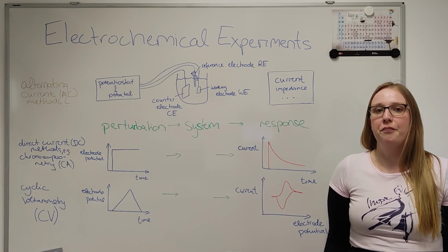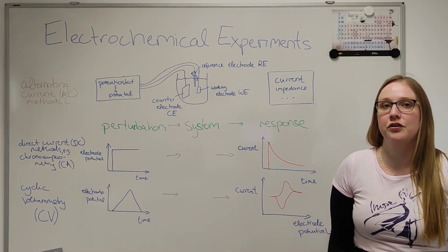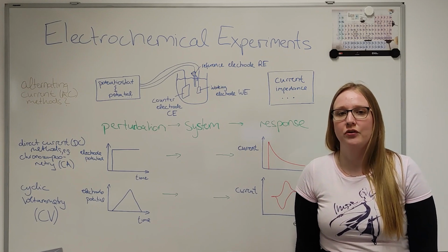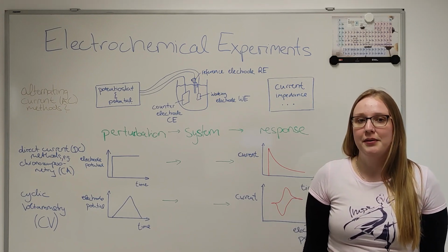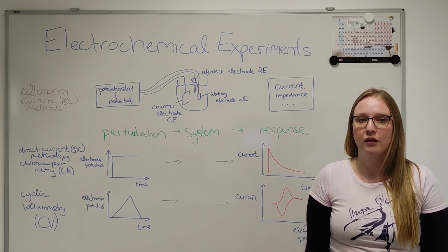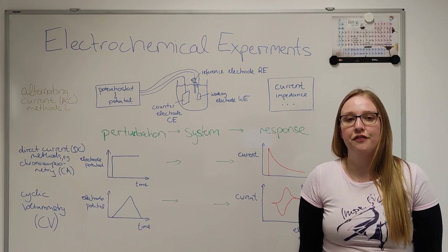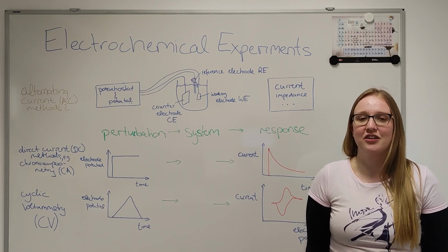The principle of perturbation and system response is the same in electrochemical impedance spectroscopy as in other electroanalytical methods. However, it is often much less intuitive for electrochemists than other approaches. One reason for this may be that it emphasizes analogies to electrical circuits to a high degree. Thus, we want to provide some refreshment for chemists in this regard. In this first video, we deal with current responses of ohmic resistors and capacitors and what impedance actually is.